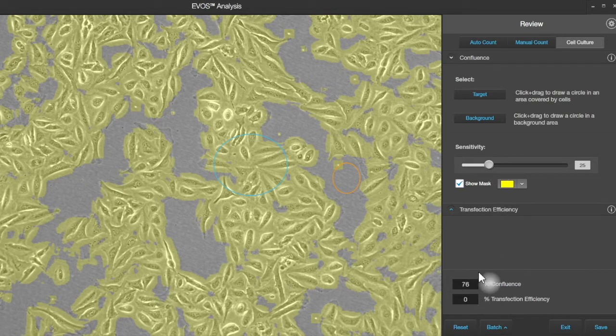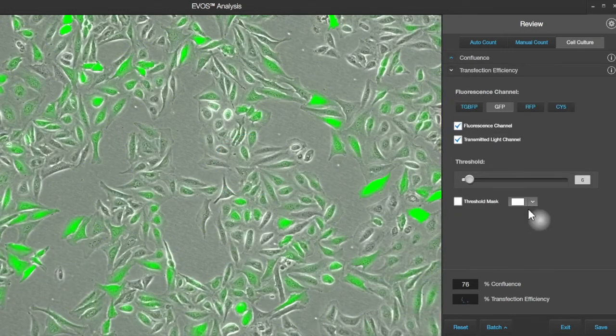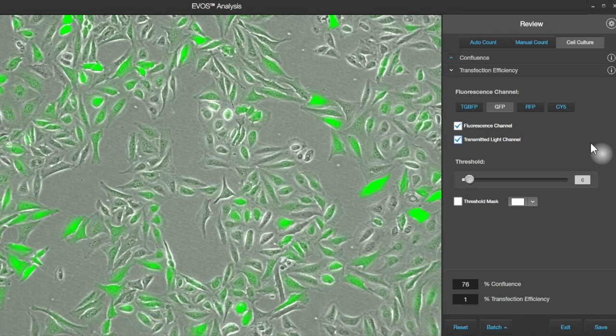We've got 76% confluence, so we can move on to doing transfection efficiency — clicking on this part of the tool opens up the controls for that.